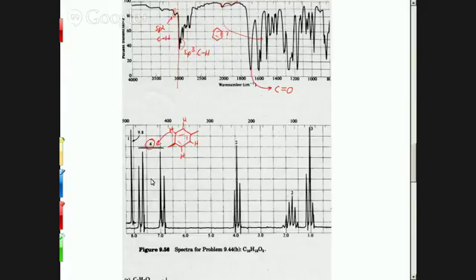So, all right, let's just look at the other peaks now and see what other types of groups we can find. What kind of groups do you see in these other peaks in the spectrum?